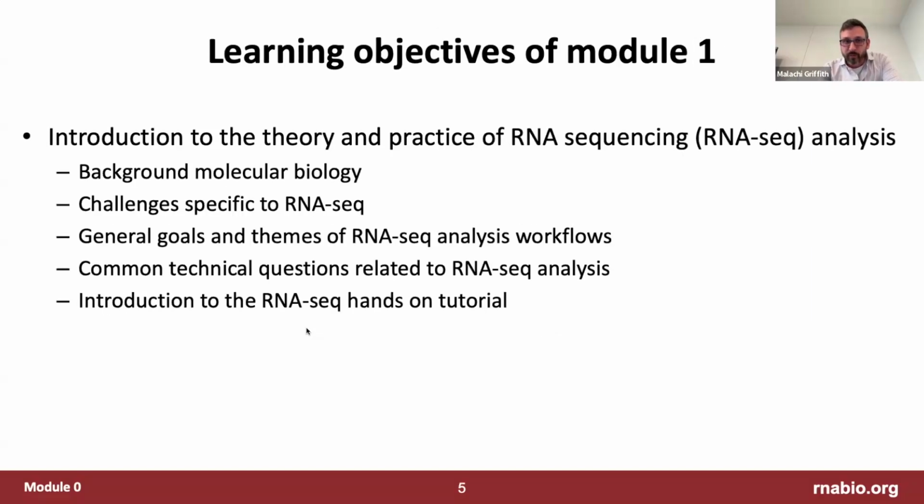Okay, so we'll go through a really basic introduction to the theory and practice of RNA-seq analysis, starting with the background molecular biology. Let's see if I can get a pointer going here without crashing everything. We'll talk about challenges that are particular to RNA-seq analysis, general goals and themes of RNA-seq analysis workflows, and some common technical questions that come up, which you're free to ask as we go along. Then we'll do an intro to the hands-on tutorial, and we'll be working through that hands-on material for the rest of the day.